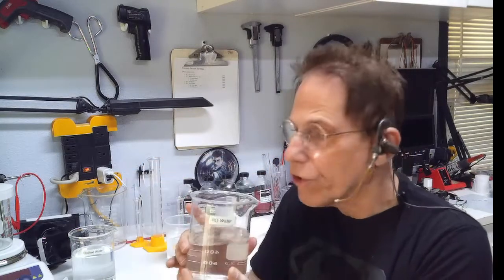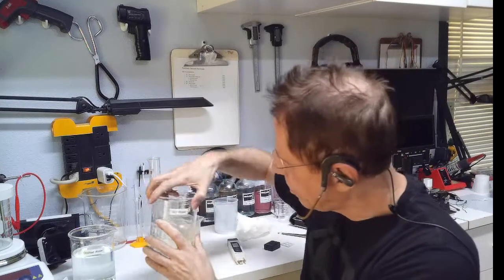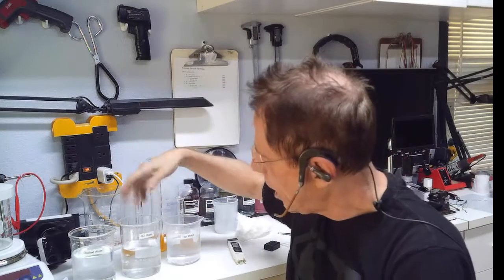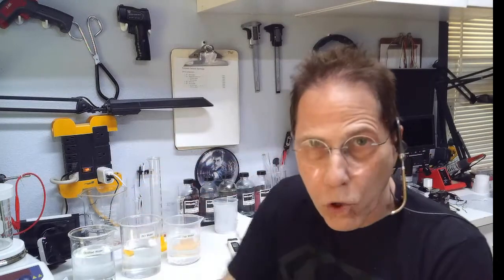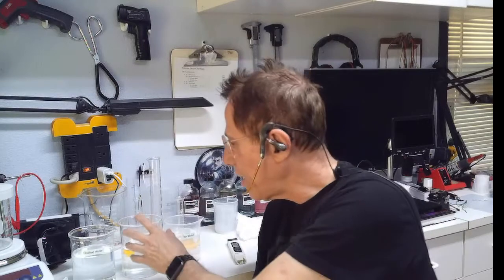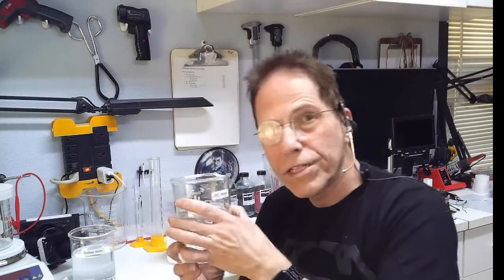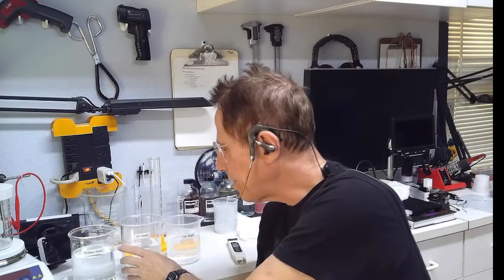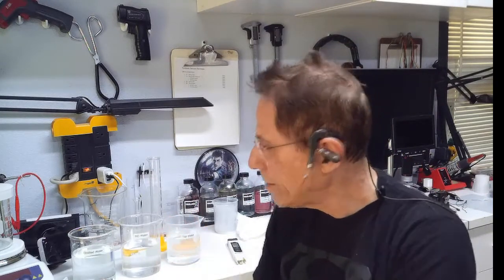Now, for the lab, RO water I use for cleaning. It's great for cleaning the beakers after I'm done with something, an experiment or cooking colloidals. If I really want to get it clean, first I will use tap water, wash it with Dawn dishwashing detergent, and rinse that all out. And then I will rinse it with RO water to get the last of the suds and the soap from the detergent out of the beaker, and then dry the beaker with a paper towel. And that will clean my beakers extremely clean, as you can see.